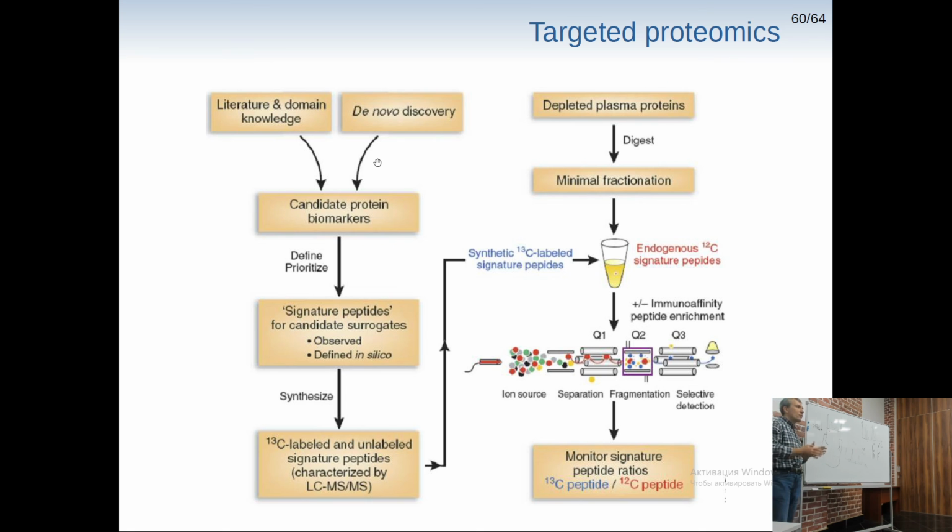As we've already covered, quadrupoles in this regime have really high transmission of ions. Almost every ion that comes to this quadrupole will exit if the mass is correct, right? So the sensitivity is really nice.